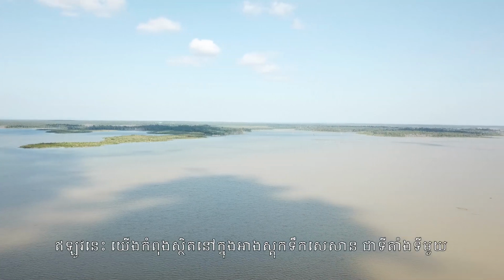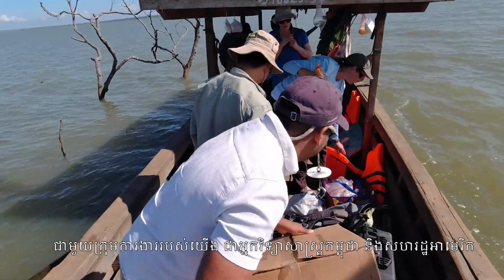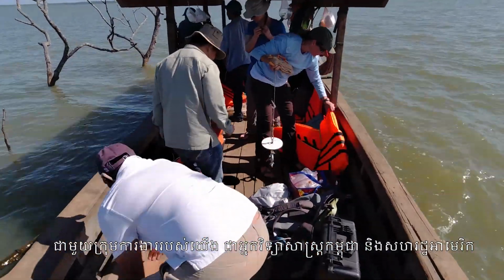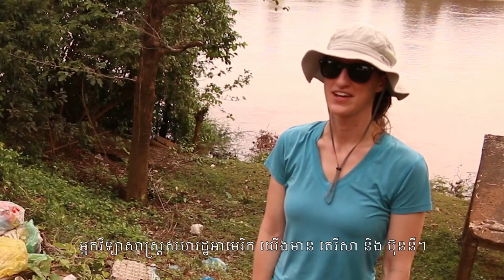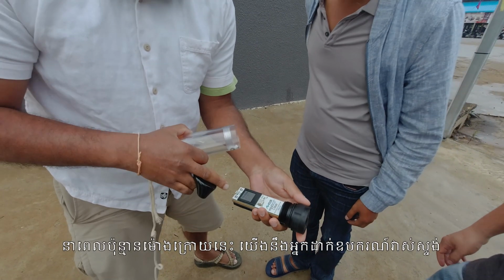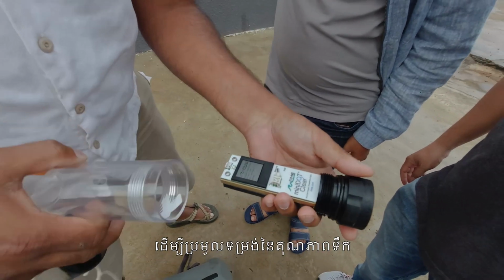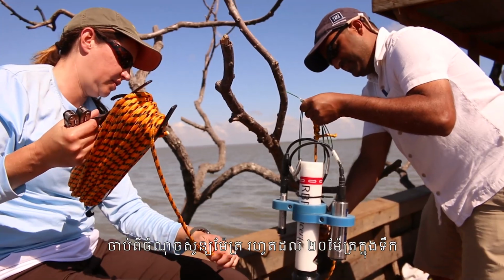We're now here on the Sesan Reservoir at our first sampling site, and we're here with our team of Cambodian and US scientists. On the Cambodian side we have Boone, Samal, and Kim San, and on the US side we have Teresa and Bonnie. And in the next hour we're going to install probes and collect water quality profiles from 0 meters all the way down to 20 meters in the water column.